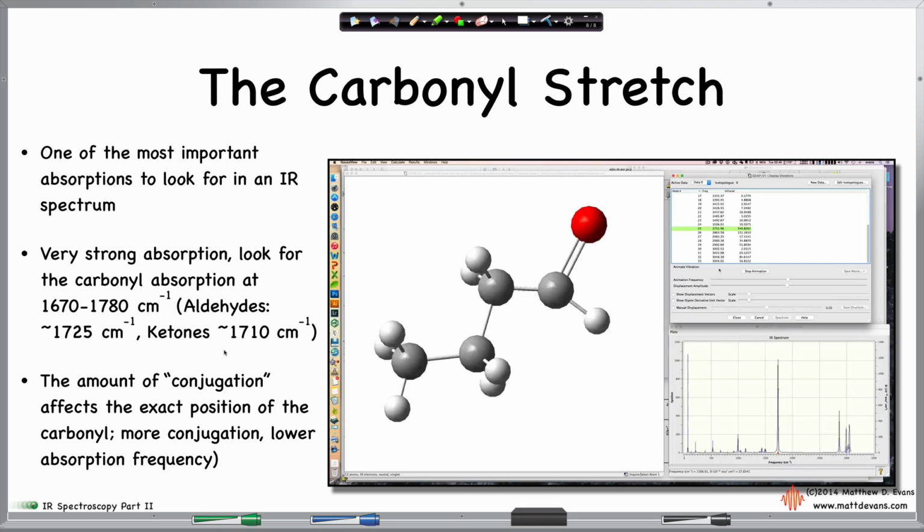One of the very first experiments coming up is you'll get a chance to oxidize a molecule, but we're not quite sure whether it produces an aldehyde or a ketone. And just by looking at where these absorptions are found, you're going to be able to hopefully tell whether it's a ketone or an aldehyde. It's sometimes tough to do.